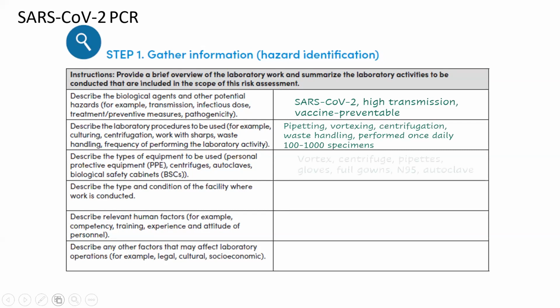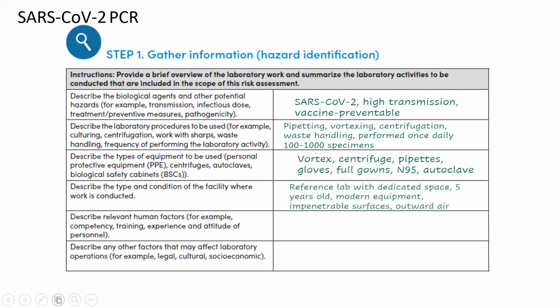The types of equipment to be used, they use all that equipment that creates the aerosols, and they have PPE, gloves, full gowns, and N95s, and they use an autoclave. Their lab is a nice lab, 5 years old, reference lab, dedicated space, very modern, impenetrable surfaces, and has negative air pressure or outward air flow.